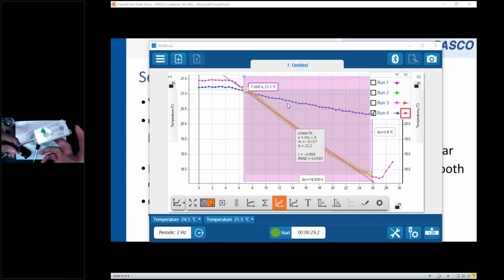Close it back up and put 2 of these together, one with CO2, one without. One will be your control. Set them in the sun for a while and see what happens with the temperature over time with carbon dioxide loaded air or just regular air to do a study of greenhouse gases and the effect on temperature.